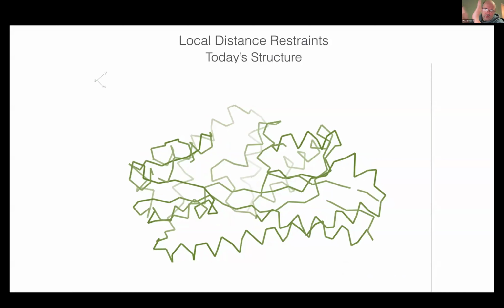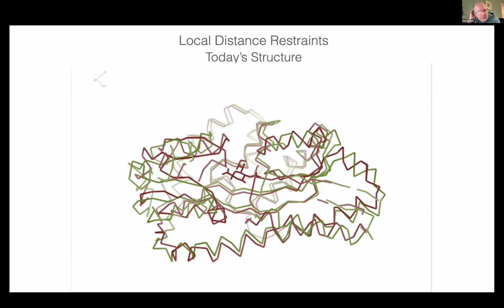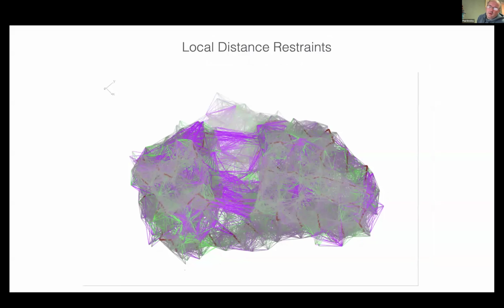In this case, we can do structural similarity comparison. That's where the idea is, but very typically in Coot and CryoEM we do self restraints. So we use starting model restraints.